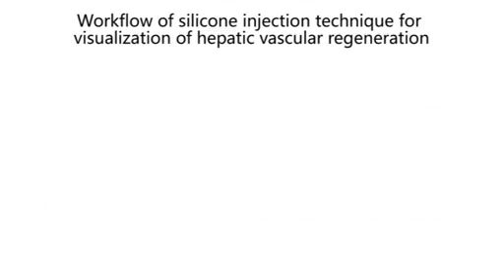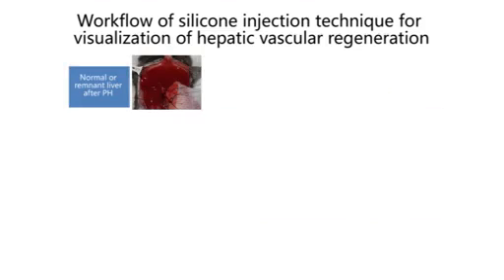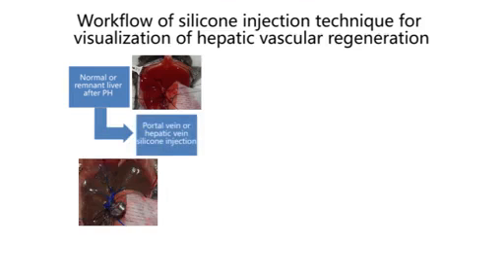The workflow starts with contrasting the vascular tree. First, we expose the liver, either a normal or a resected one. Then, we inject a polymerizing silicon contrast compound into either the portal vein or hepatic vein, depending on the vascular system of interest.